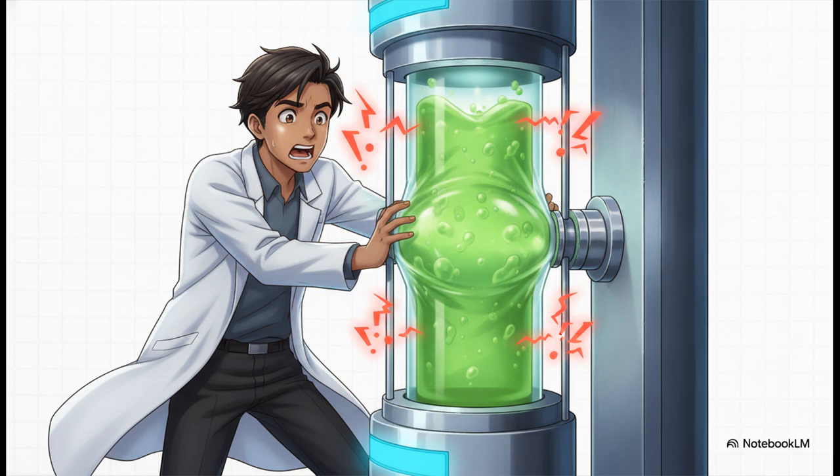There are always trade-offs in method development. You can't just swap a toxic solvent for a highly biodegradable green one like propylene carbonate and expect your system to run exactly the same. PC is amazing for the environment, but it's thick. Its high viscosity causes massive pressure spikes in the column, which means you actually have to recalibrate your equipment or mix it with something like ethanol just to keep the whole system from overpressurizing.